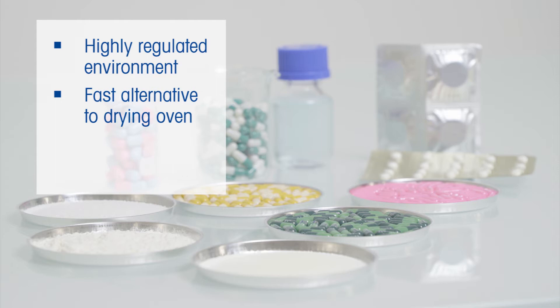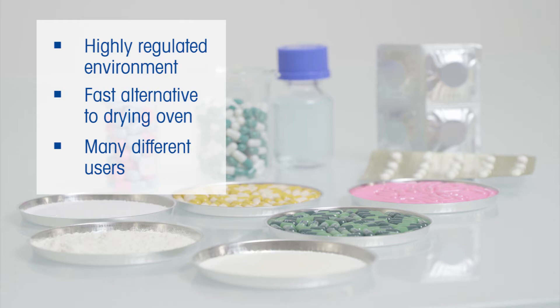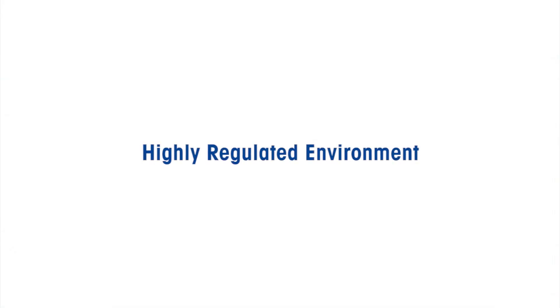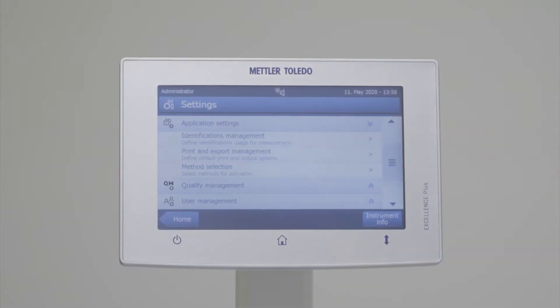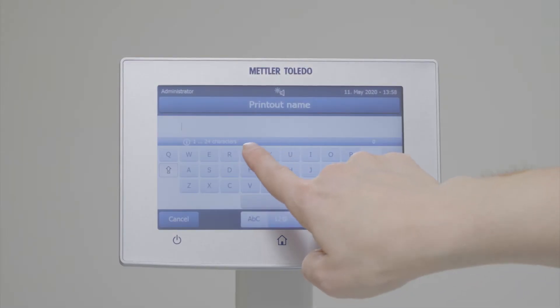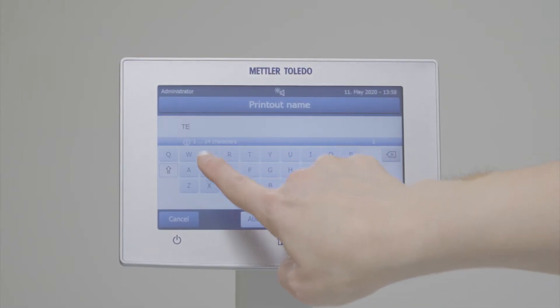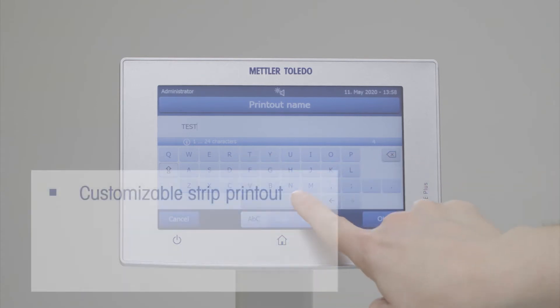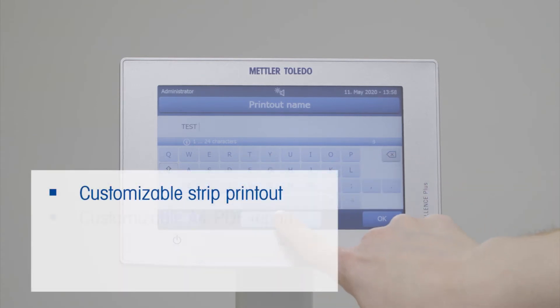You need a fast alternative to the drying oven method, and many different people will be using the same instrument. In a regulated environment, data management in general is essential. With the Mettler Toledo excellence moisture analyzers, both strip printouts and A4 PDF reports can be customized to include various parameters.